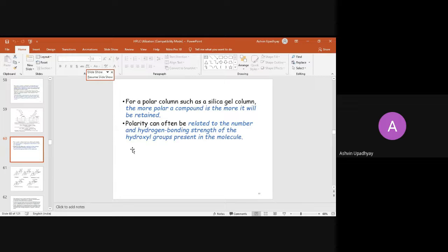So with HPLC utilization, you have to check whether your compound or the impurities are polar or non-polar. When sample A is analyzed on a polar stationary phase column and the same sample is analyzed on a non-polar column, your elution order changes. In a polar column, impurity A is available at 2 minute RT, impurity B at 3 minutes, impurity C at 4 minutes, and your analyte at 5 minutes. But on a non-polar column, your main analyte will come at 2 minutes, impurity A at 4 minutes, and impurity B might be at 1.5 minutes.